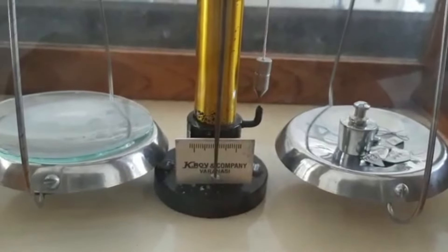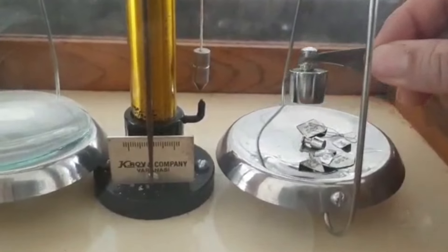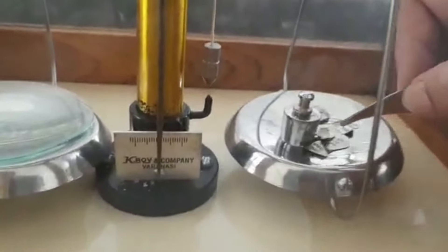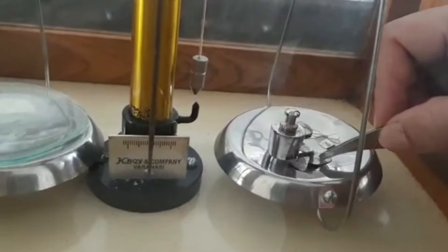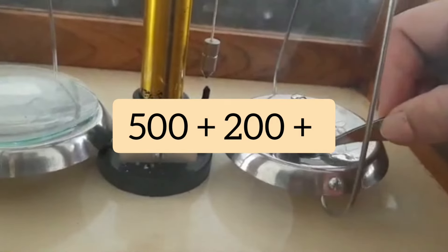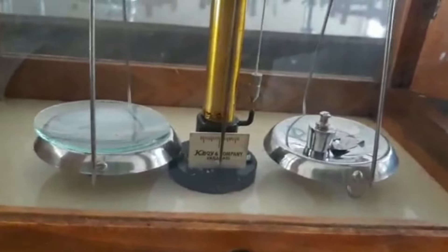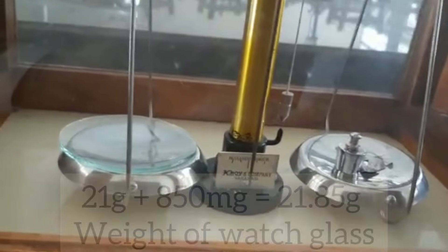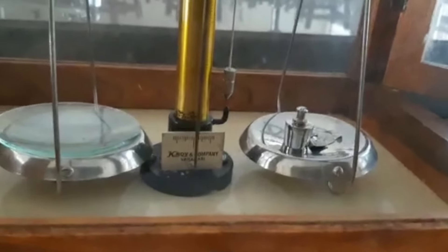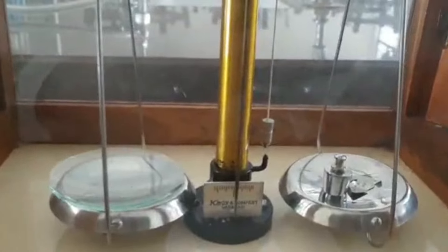I add up all the weights: 20 grams plus 1 gram is 21 grams. Counting all the milligram weights: 500 plus 200 plus 100 is 850 milligrams. So the weight of the watch glass is 21 grams 850 milligrams. Now I want to weigh 2 grams of salt.